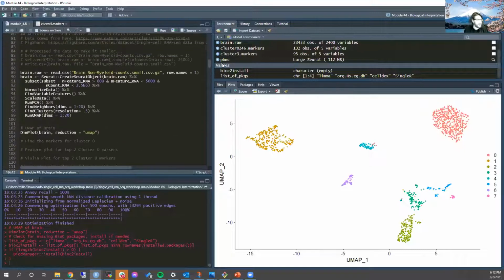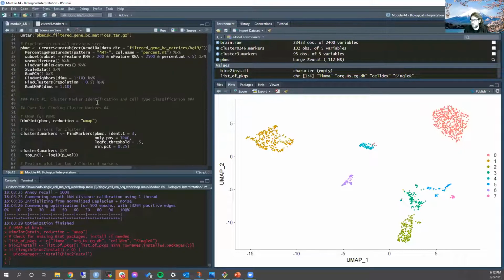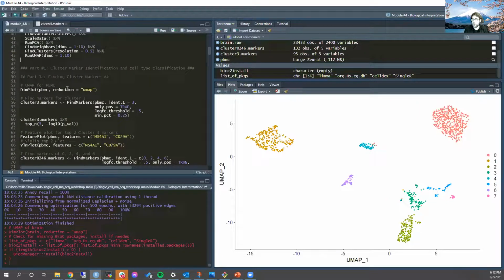Oh, okay. But I think SingleR has to call CellDex, doesn't it? No, it has a built-in function to do that. You don't need to install it separately or call it separately. All right, never mind. You actually apparently will not need CellDex. But there are some databases in CellDex that aren't in SingleR, so I wasn't sure. It depends on which database you're using.